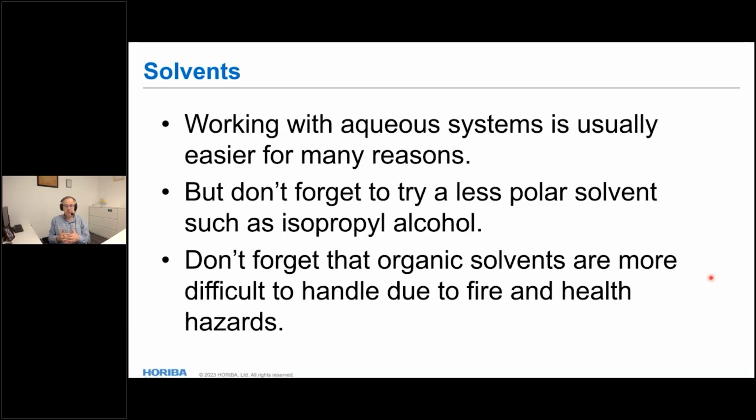I've mentioned polymers a few times. I should add the comment that in dynamic light scattering, when we analyze polymers, it's very much like particle analysis. And so you can prepare a polymer solution and see your coil size, hydrodynamic size of the coil with dynamic light scattering. It's a pretty classic experiment. And so you can track all sorts of things about polymers this way.